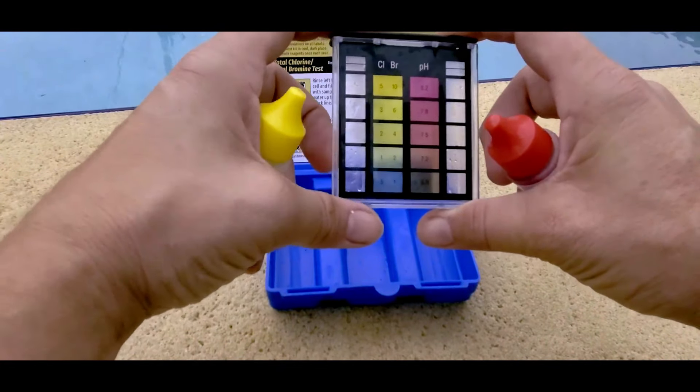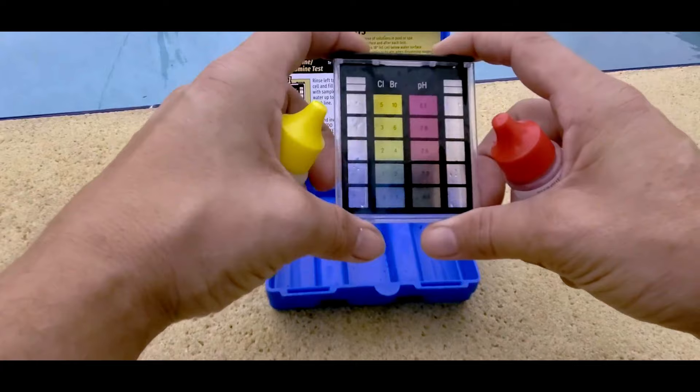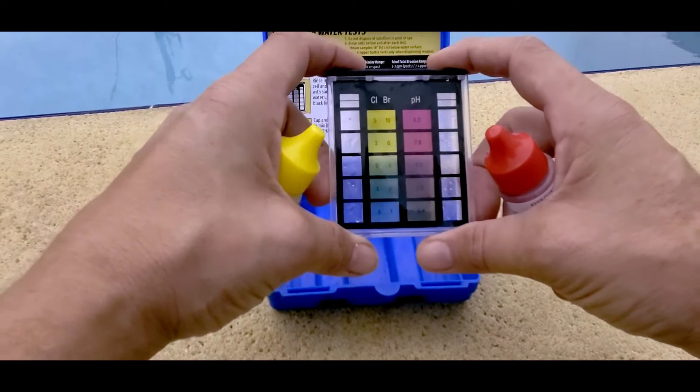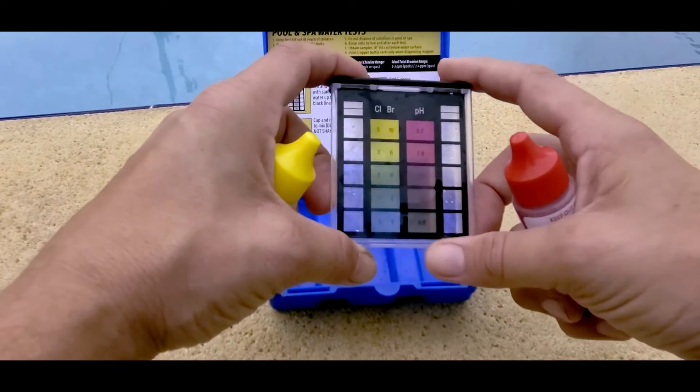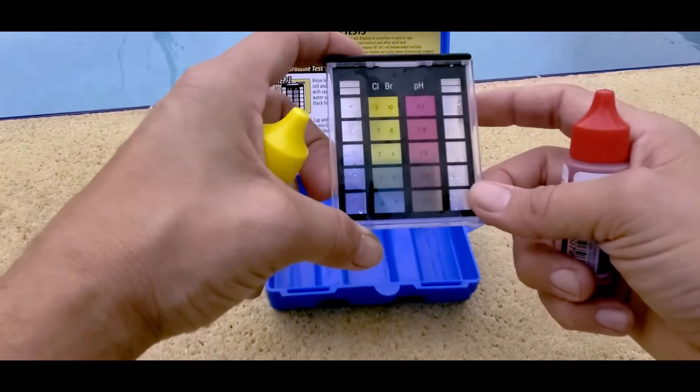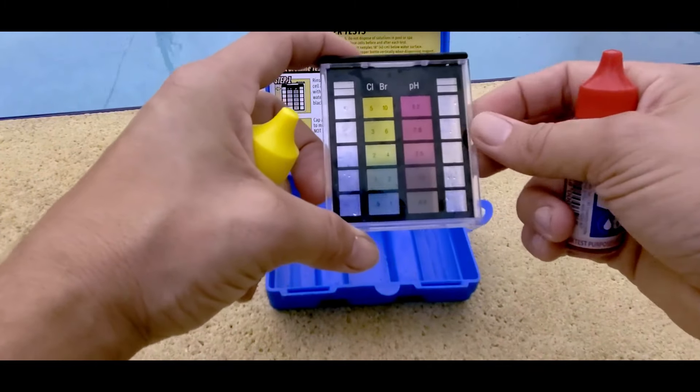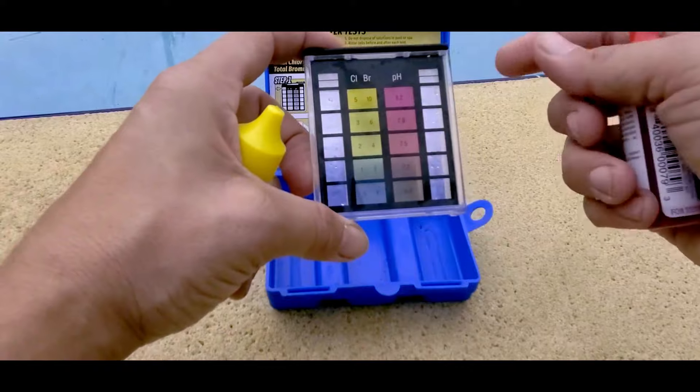Both of these numbers can vary slightly based on if you have a fiberglass pool or a plaster pool. So the type of pool matters. And you can just look up what level your pool should be at. And it's pretty easy to test with this.